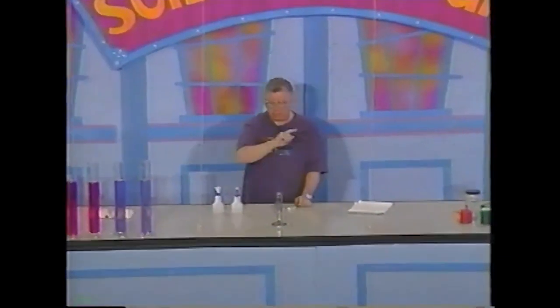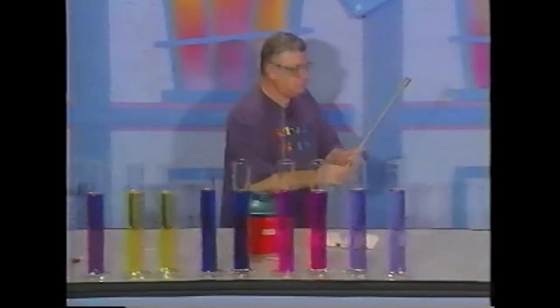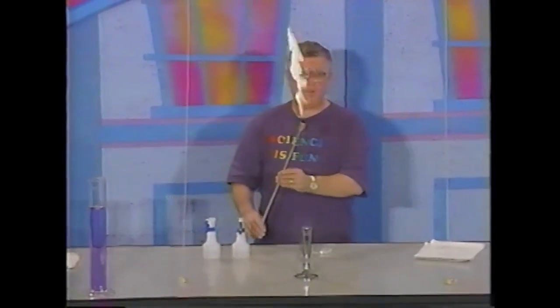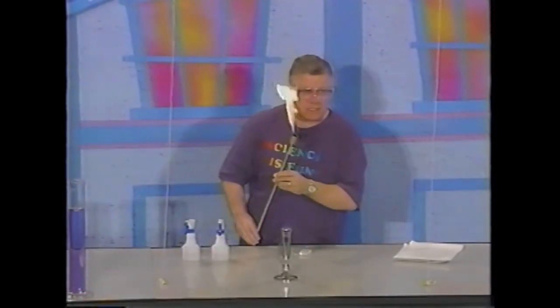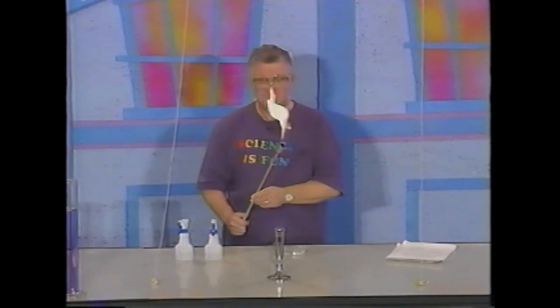There is a combustion reaction going on in that burner, and I'm going to use a different burner right now to ignite, again, natural gas, but you can see that the flames have different colors. What color is this one? And this is an example of what we call a controlled combustion reaction. Nothing is going out of control as long as we are careful.